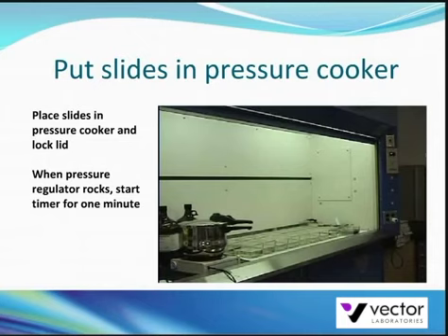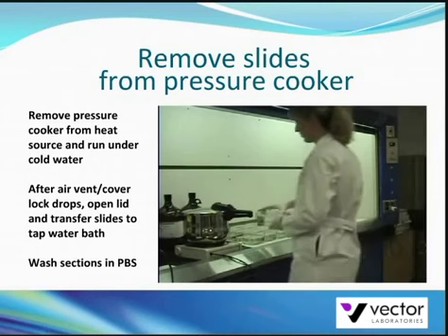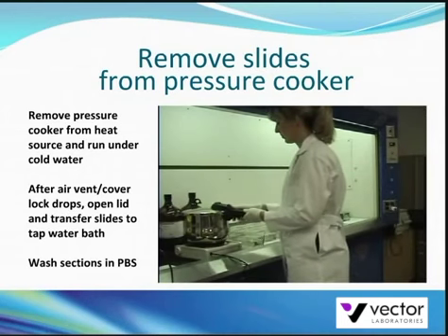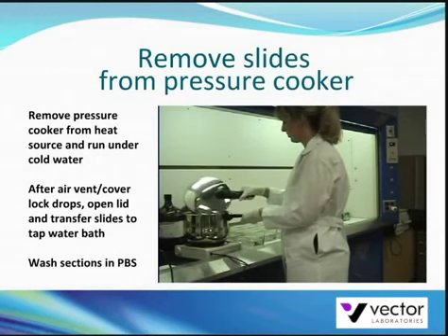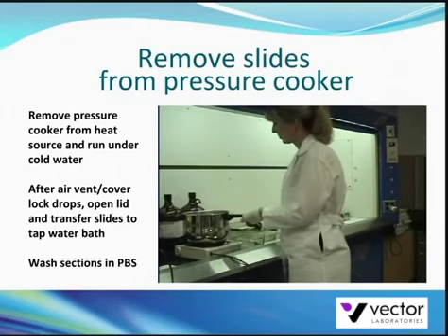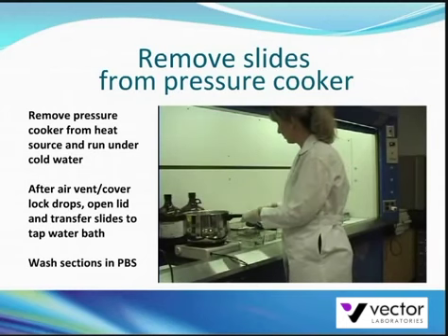For your safety, do not open the lid until the internal pressure of the pressure cooker has been completely reduced and the air vent cover lock drops. After the air vent cover lock drops, open the lid.